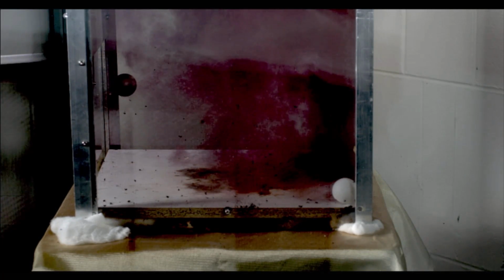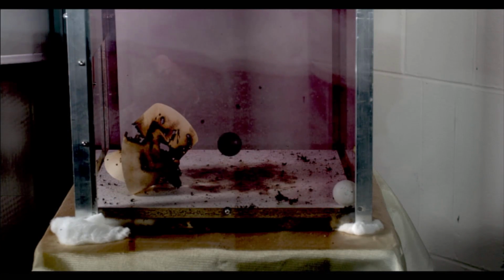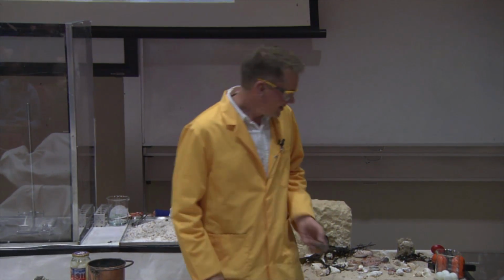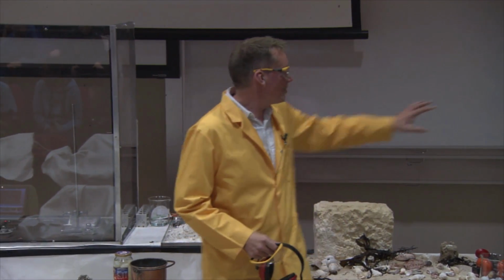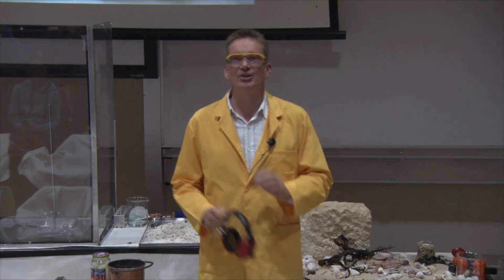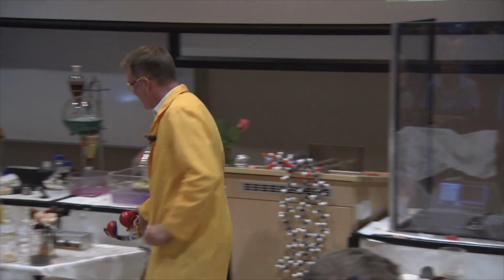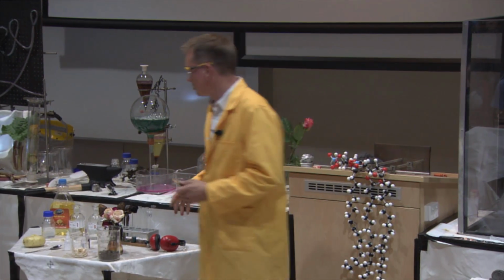But look what you've done to my ping pong ball. It's dead. It's destroyed. Okay, so yes, a very violent reaction took place there. But notice the purple colour, and that purple colour that you see there is iodine. Okay, so it's iodine molecules, I2, floating around. Now actually, this is quite nice, the iodine. We can use this in a nice chemical test.